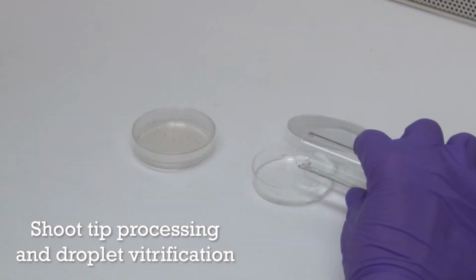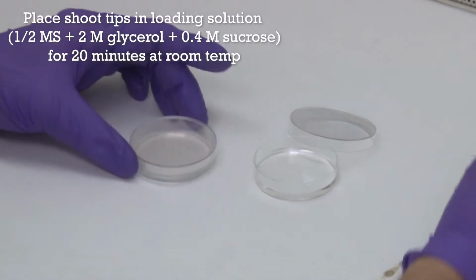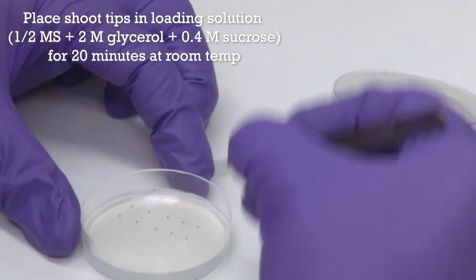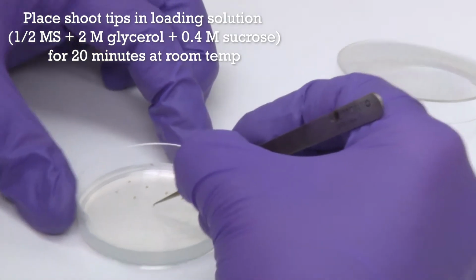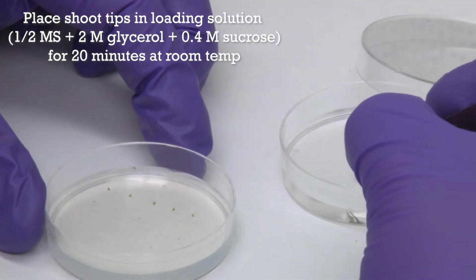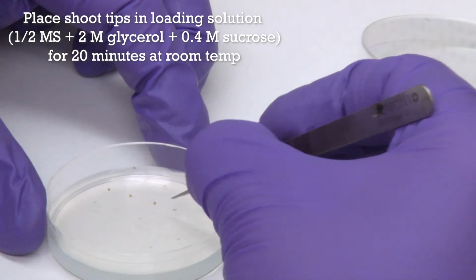And now we are going to show the droplet vitrification process for the shoot tips. The shoot tips are going to be removed from the pre-culture medium, being very careful not to put any pressure on the shoot tips, but just lifting them off of the medium and into the loading solution.